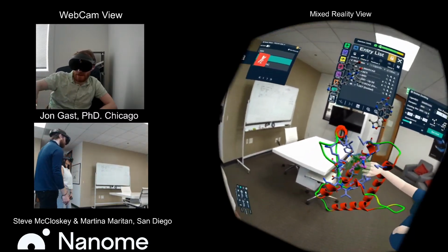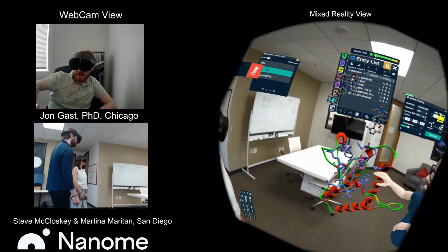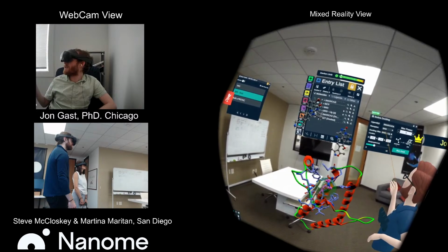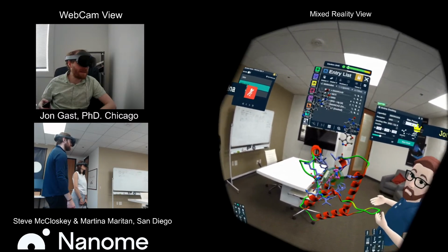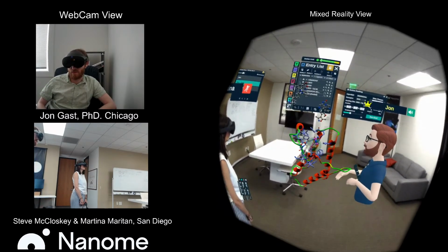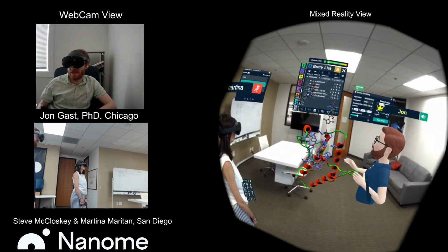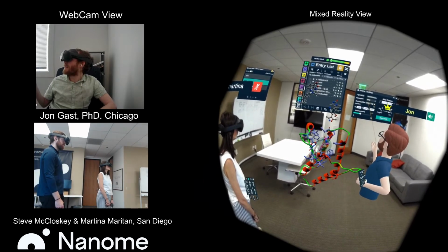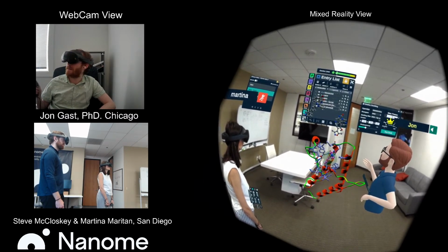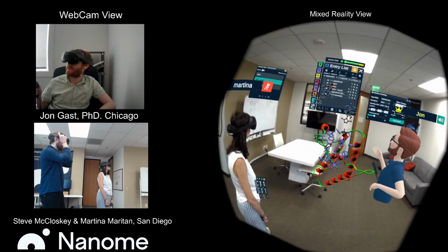I can see there in green the area that's going to be searched for different conformations. I like using co-crystal ligands as my docking site in Nanome. It's just a nice, fast way of getting a pretty reasonable grid. Of course, we can customize that later, but you can see how easy it was to set up. Let's take a look at some results together.